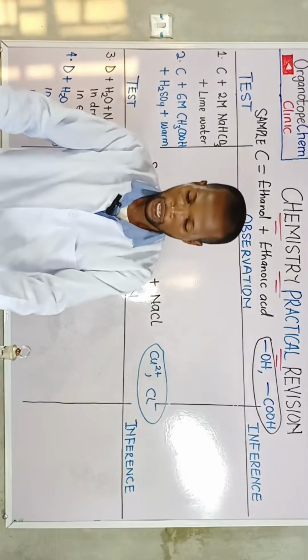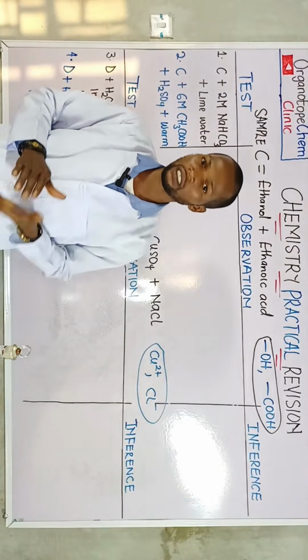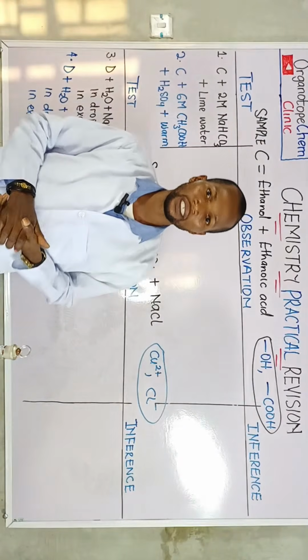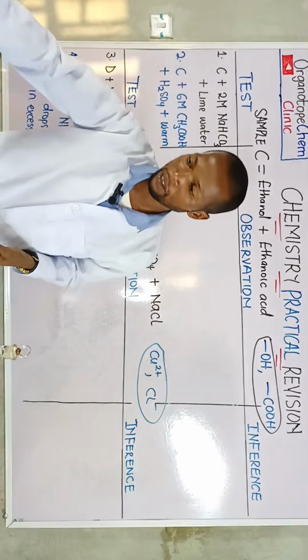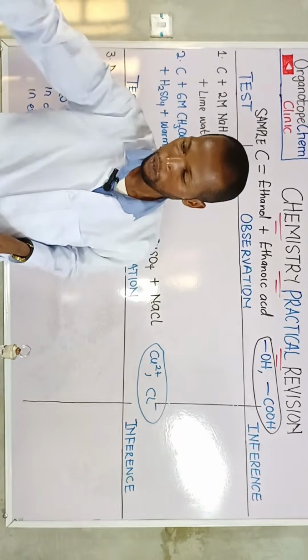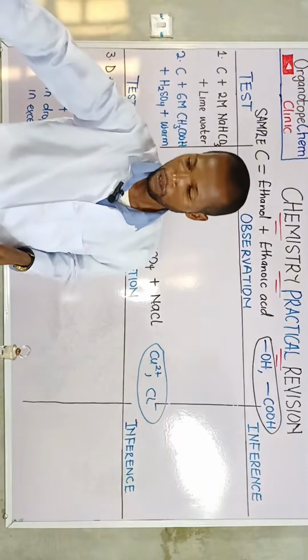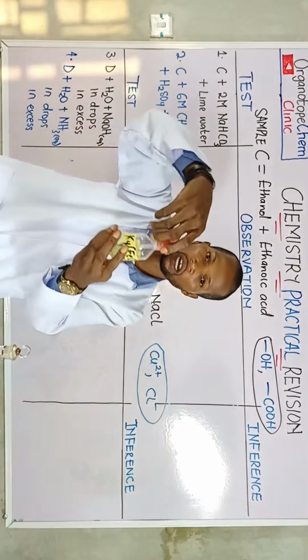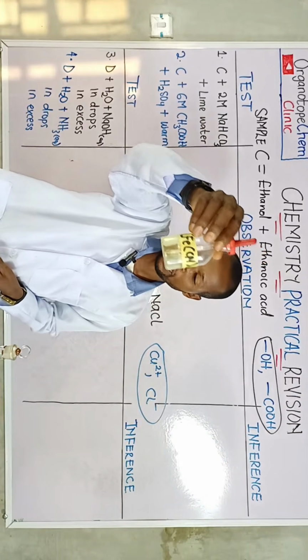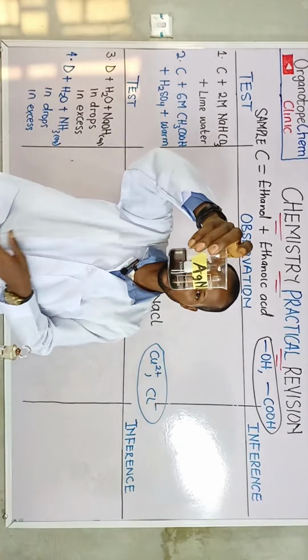Okay, now we are going to identify the reagents that have been provided for this qualitative analysis. So the reagents are: we have the sodium hydroxide right here. We have aqueous ammonia right here. We have potassium hexacyanoferrate(II) right here. We have silver nitrate.